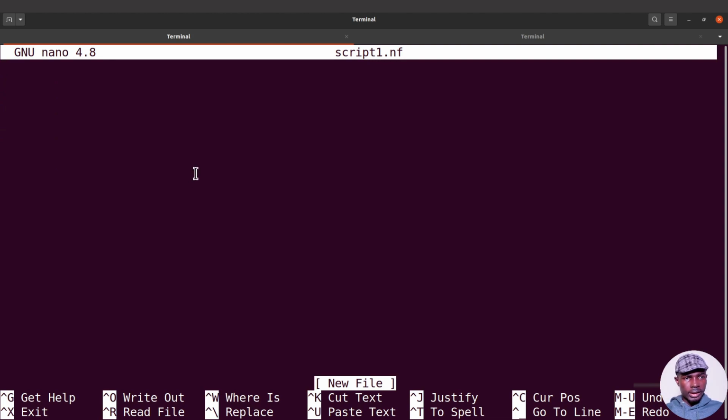Okay, so I have done that. Now that's what we are going to do. We are going to specify a parameter. All right, so I'll say params.FASTA, or you can also say ref. I think I'll prefer to use ref rather. So I'll say params.ref equals and I'll specify the path to the sequence. All right, I mean the FASTA sequence.